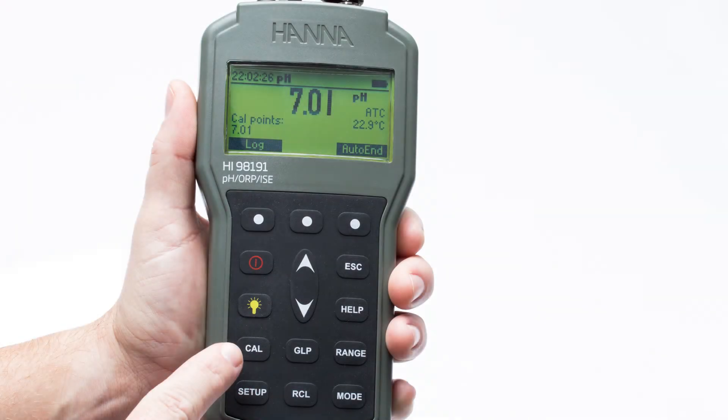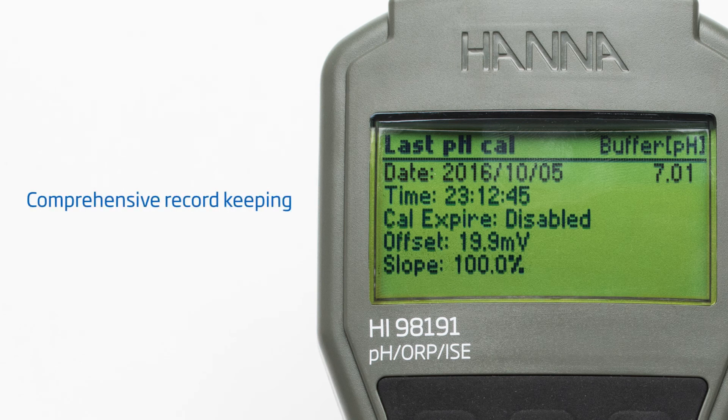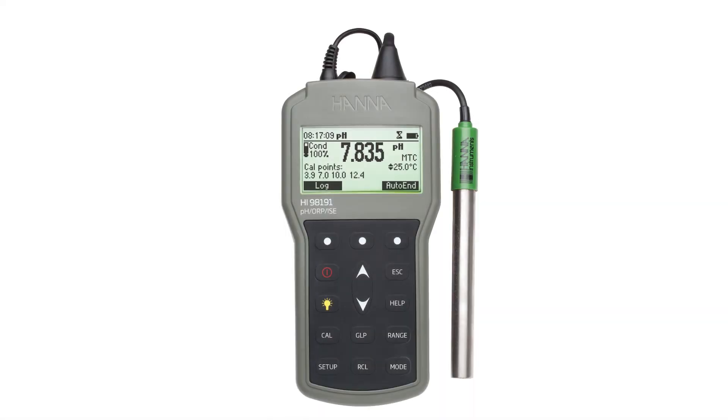Pressing the dedicated CAL button enters automatic calibration. Calibration data is stored upon exiting and can be reviewed by pressing the GLP button. The GLP data includes the last calibration date, time, days to expiration when calibration timeout is enabled, calibration points, offset, and slope percentage. The stored GLP data and log measurements allow for comprehensive record keeping for any reporting purpose.